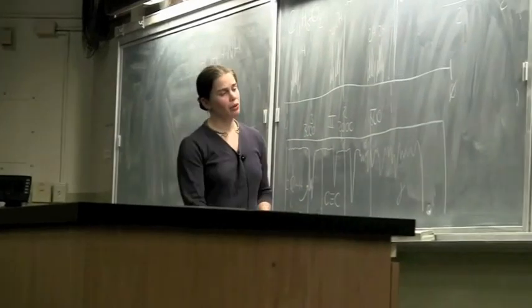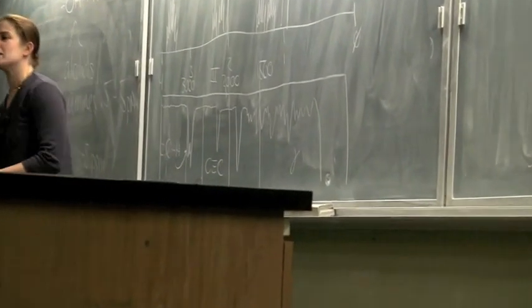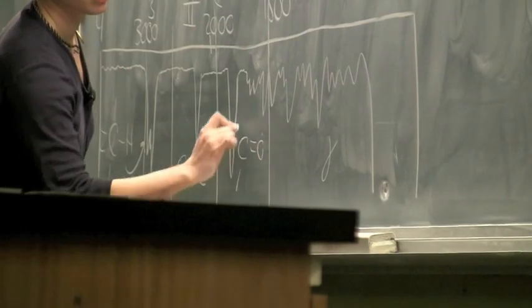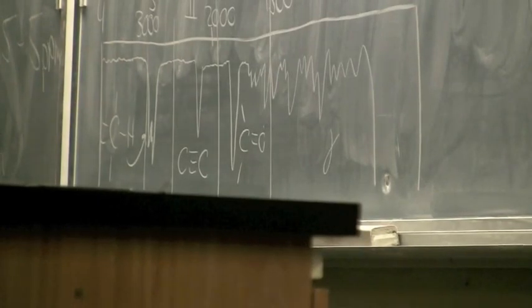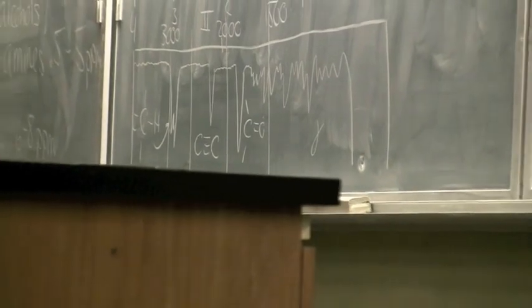So we could keep going. We've got this double bond peak. It's more to the left side of that zone on the right. It's probably closer to 1700 than it is to 1600. That's probably a C double bond O. Another clue that it's a C double bond O is we don't have these C double bond C hydrogens. Unlikely to have an alkene without any hydrogens. It's not impossible, but it's not terribly likely.